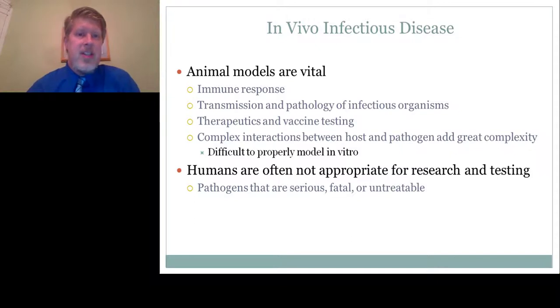So to set the stage, within infectious disease research, in vivo animal models truly are vital. This is a very complex discipline. There are a lot of pieces that have to fit together. And working in lab animals is one of the principal ways that we're able to more precisely model the environment that our therapeutics, or even basic research, are going to be applied within.